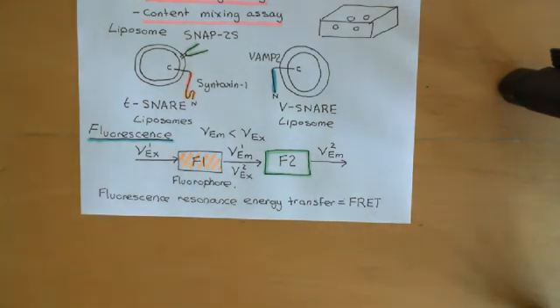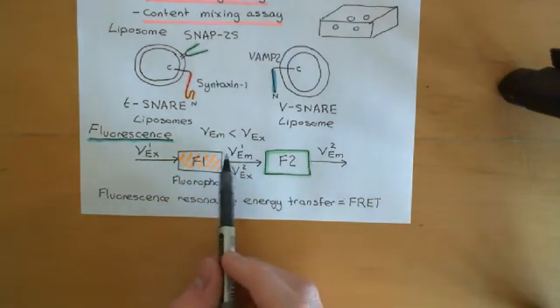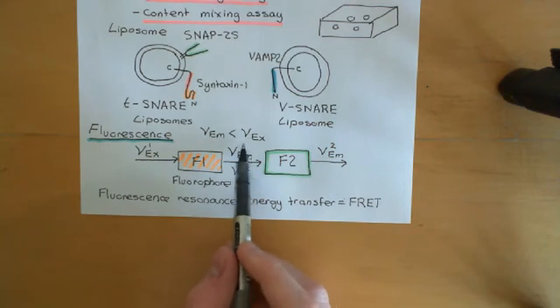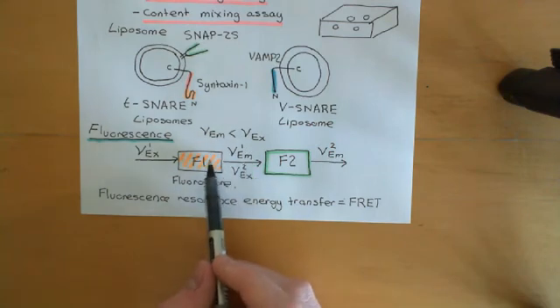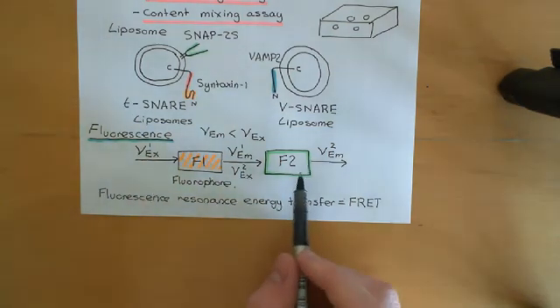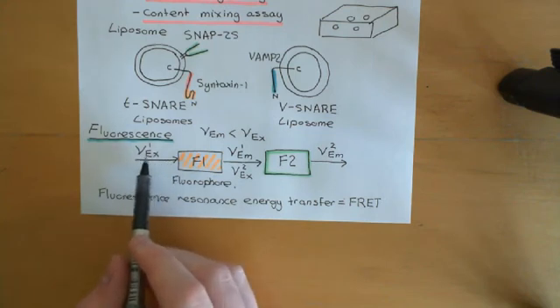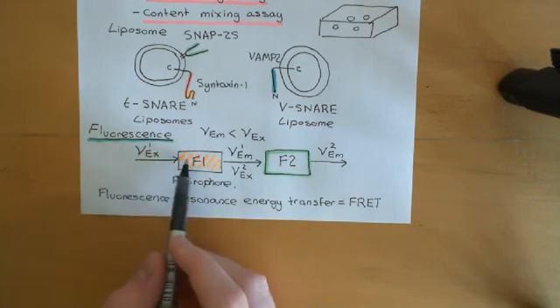Okay, and this concept is going to be extremely important in the lipid mixing assay, because if you mix these two fluorophores, you are now not going to get that much light of the emission frequency of fluorophore 1 actually coming back to you. So let's say you have a medium containing these two fluorophores, and you shine electromagnetic radiation of the excitation frequency for fluorophore 1 on.